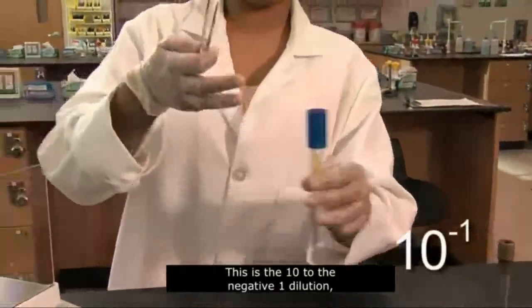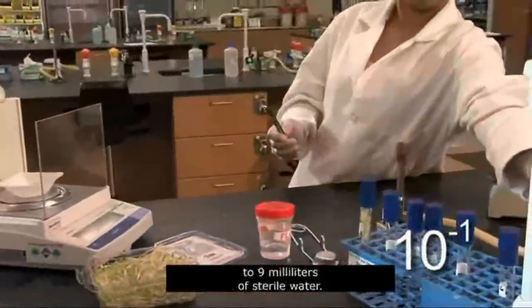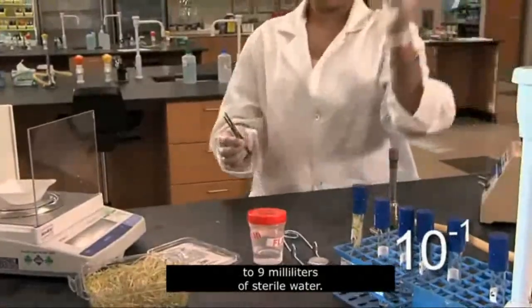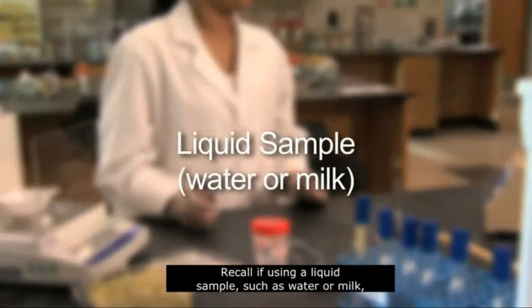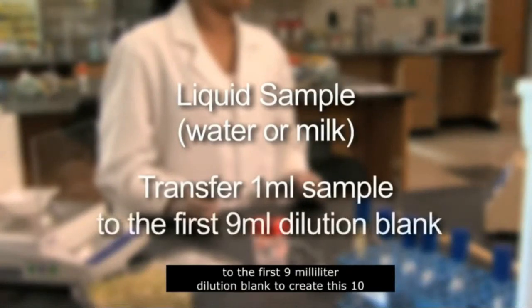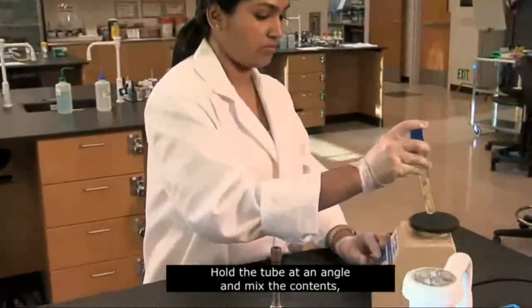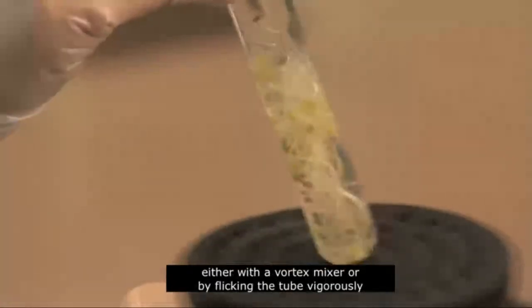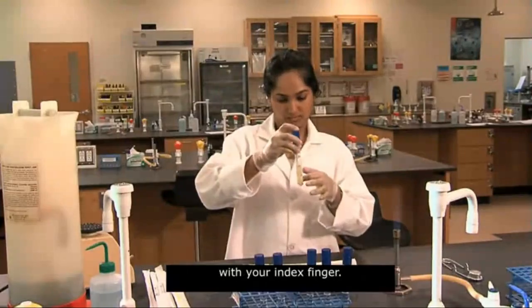This is the 10 to the negative 1 dilution, since we're adding 1 gram of sprouts to 9 milliliters of sterile water. Recall, if using a liquid sample, such as water or milk, we would simply transfer 1 milliliter of sample to the first 9 milliliter dilution blank to create this 10 to the negative 1 dilution. Hold the tube at an angle and mix the contents, either with a vortex mixer or by flicking the tube vigorously with your index finger.